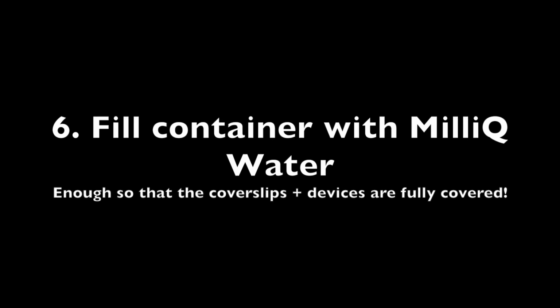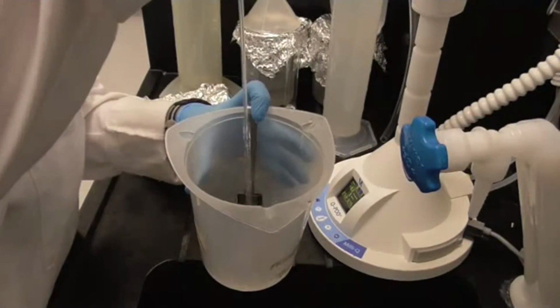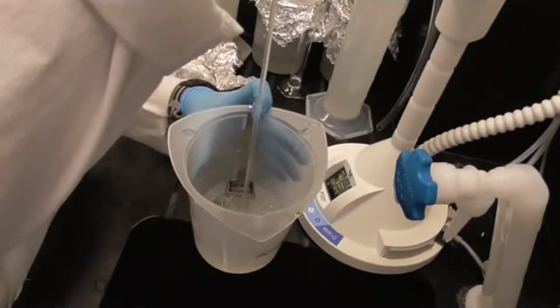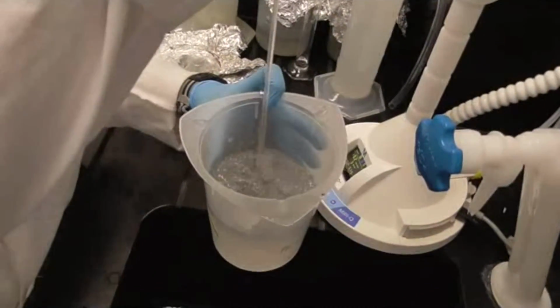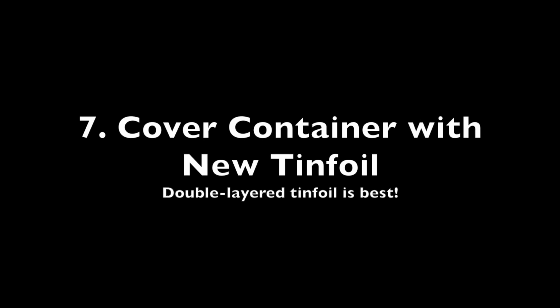After this is done, fill the container up until the cover slips are covered with milliQ water. Now you want to recover the container with new tinfoil, double layered being best.